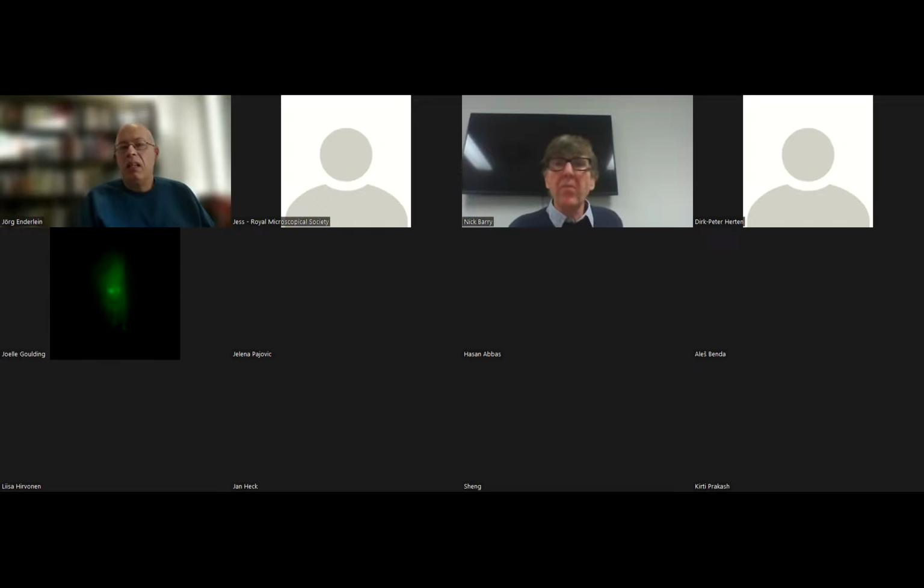Brilliant, thank you. Okay, well, actually, I have a couple of questions. I noticed on your graphene version of this that you had a silica and a poly-L-lysine layer on top of the graphene. Is that for adherence, or is that for some other purpose? And does it have an effect in terms of its dielectric properties?